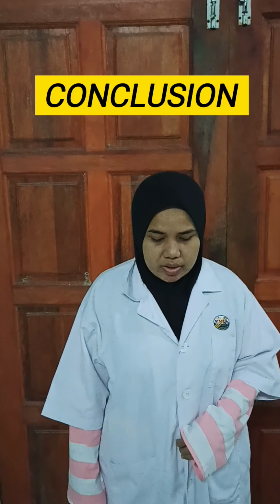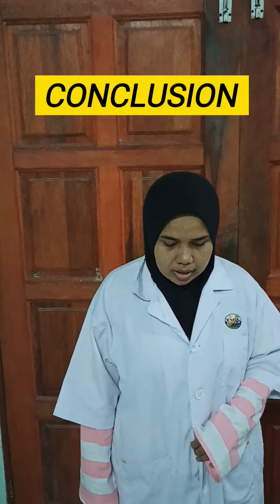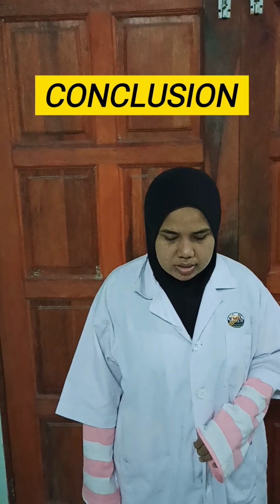So in conclusion, the objective of this experiment was achieved. So the objective of familiarizing oneself with different colors of soil, the Munsell color chart for soil color determination was applied, and soil color at field using the Munsell color chart was determined. So that's all from me.